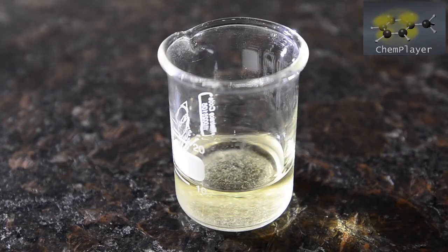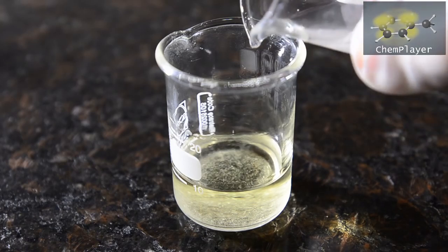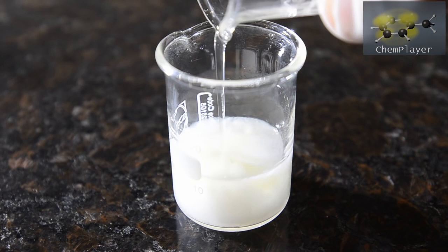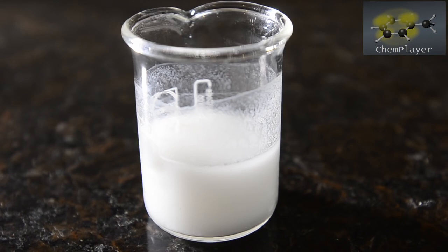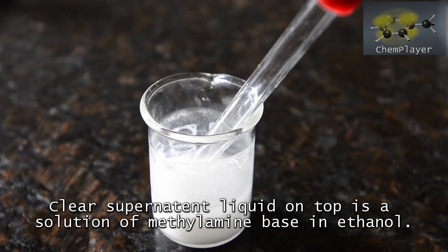We added the ethanolic potassium hydroxide solution to our methylamine hydrochloride solution. A white precipitate of potassium chloride, which is insoluble in ethanol, was formed. We left this for a few minutes to settle. And the clear supernatant liquid on the top is our methylamine solution, which is our catalyst.